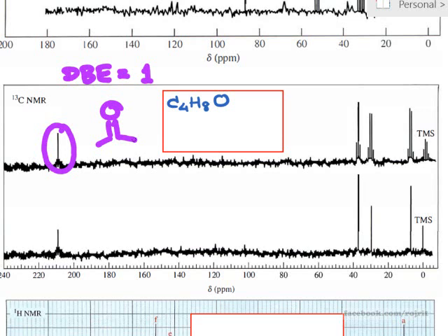Okay, so we used already one carbon, and we know that it is a ketone because we have only one oxygen, right? So it has to be carbonyl. Carbonyl with two carbon sides can be just ketone or aldehyde because we don't have nitrogen or another oxygen, right? So it has to be aldehyde or ketone. But this is a singlet. This is a ketone.